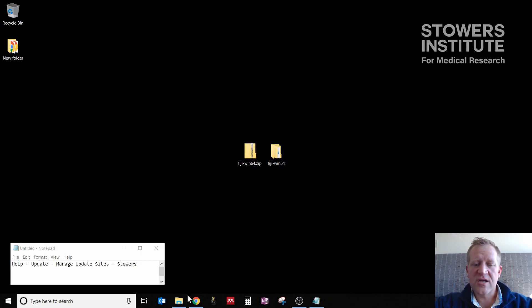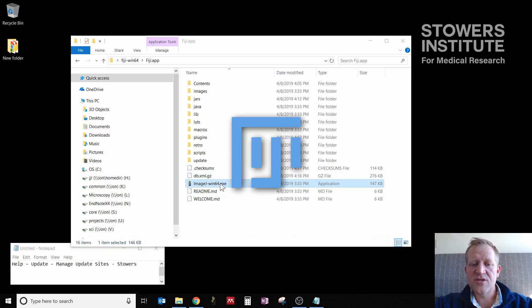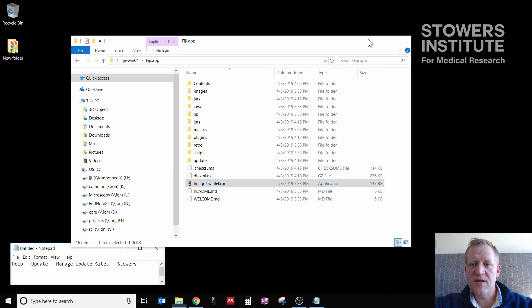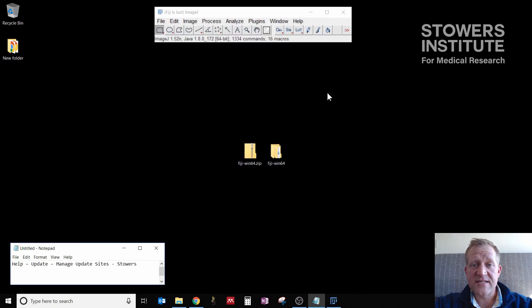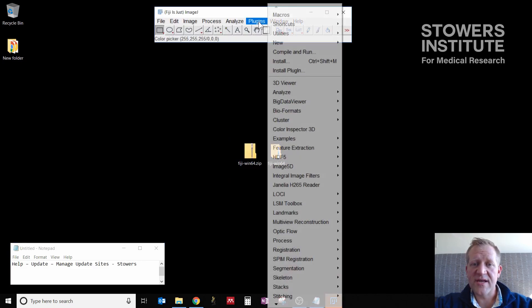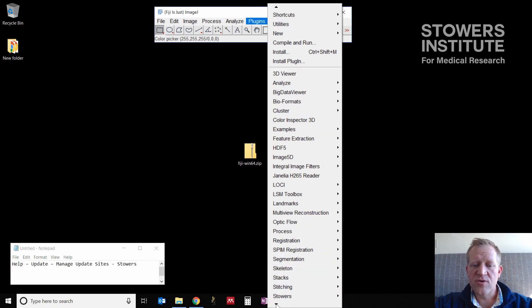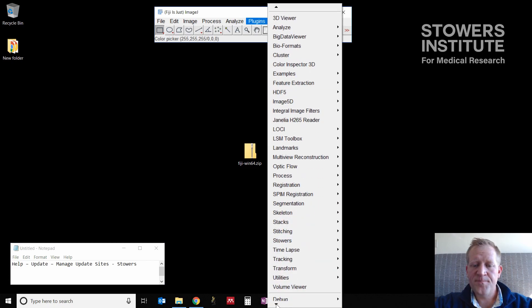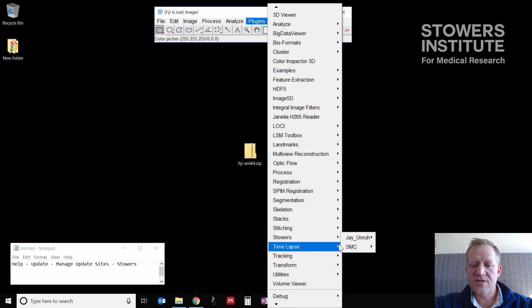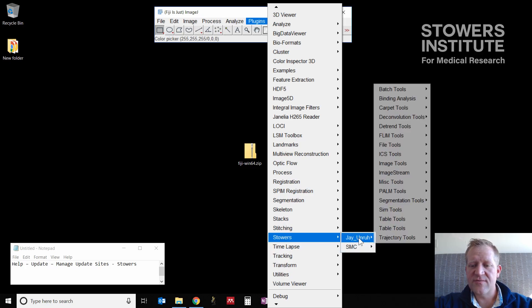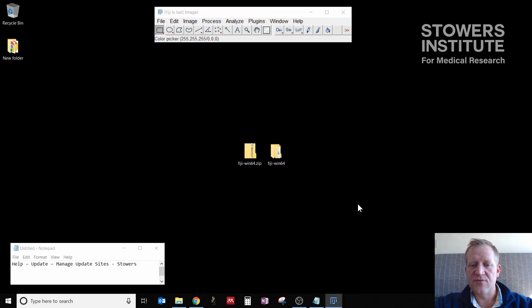At the end of this, you notice that Fiji tells me it's updated successfully and to restart ImageJ. This is exactly how Fiji handles updates all the time. So once I close it, I can now go back into my folder, relaunch the executable, and I'll get Fiji back. Then we can check quickly for all the plugins that we've installed. To do that, you go through the menu of Plugins, scroll down, find Stowers, and you now notice that we have a bunch of different plugins that we can use.